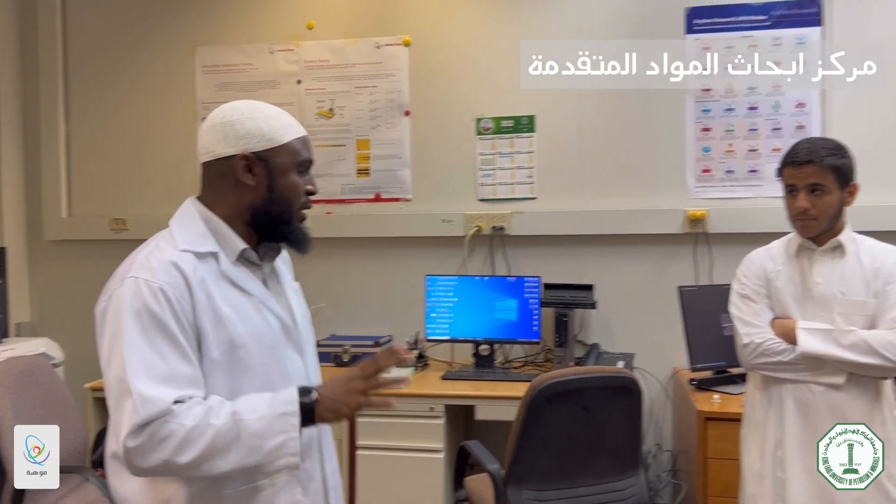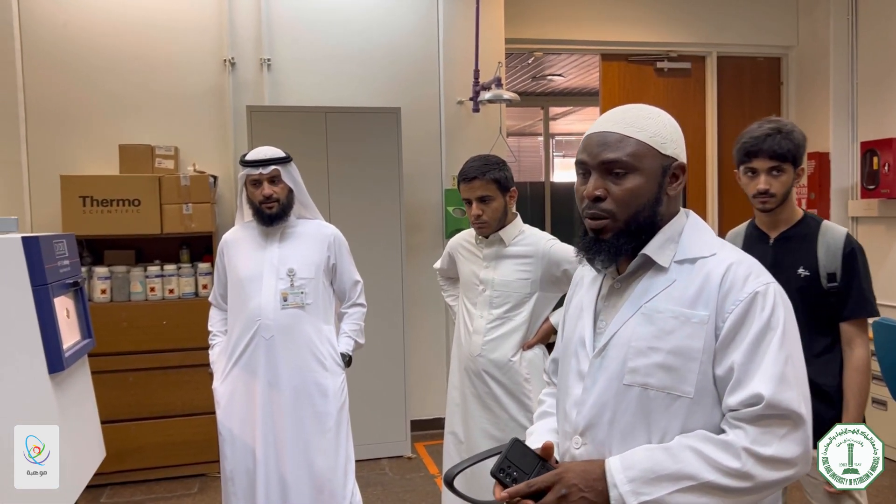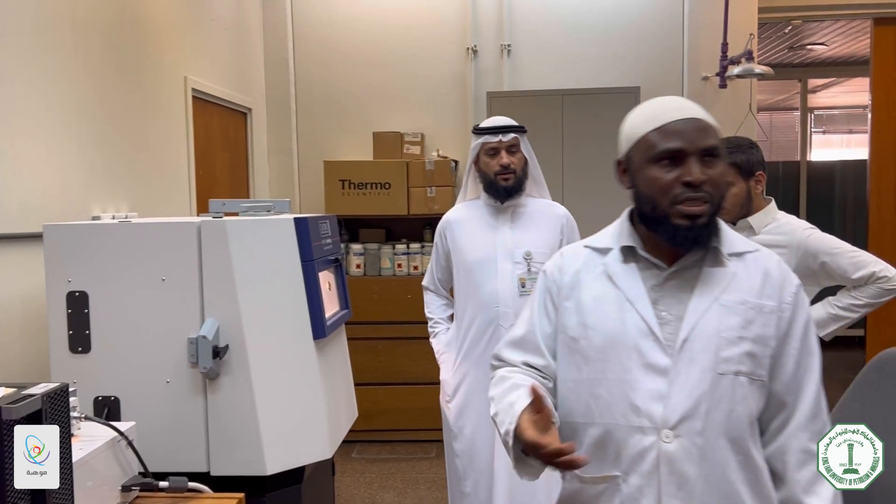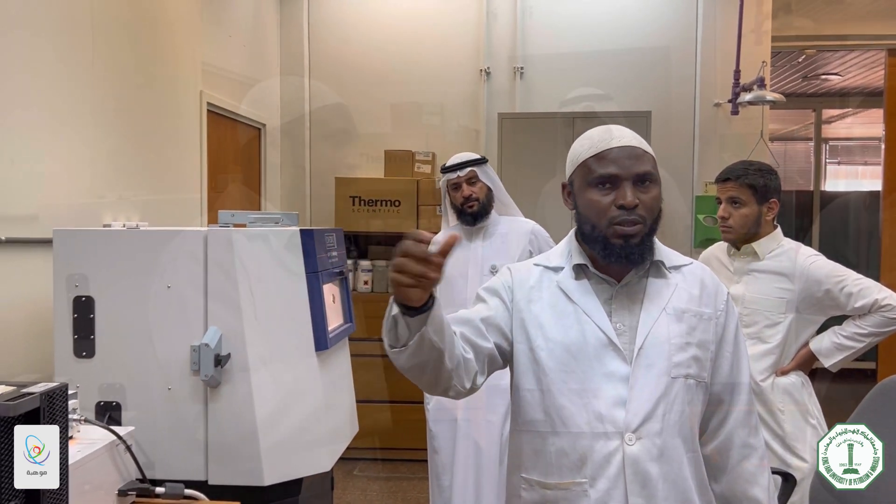We have four modules. We have the micro-indentation module, which you can use to measure the mechanical properties at a micro scale. We have the nano-indentation module — you indent the material for a particular period of time, and then measure the force over the contact area. We also have the atomic force microscope, which is a microscope at the size of an atom. You can use this very tiny cantilever — there are several instruments for studying structure.